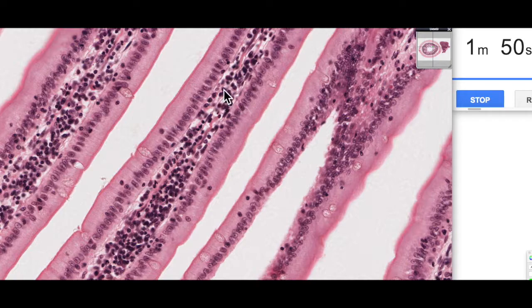You can see these other cell types within this loose connective tissue beneath this simple columnar epithelium here. You can see that there's not a lot of cytoplasm in a lot of these and a lot of these are actually lymphocytes which have large nuclei in relation to their cytoplasms.